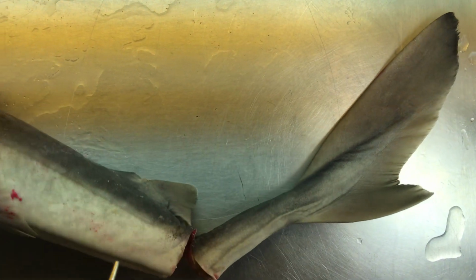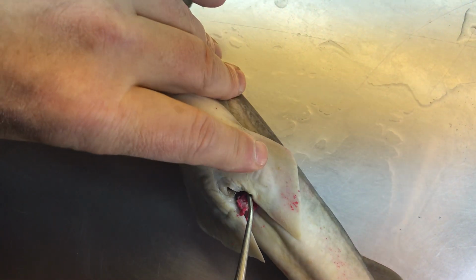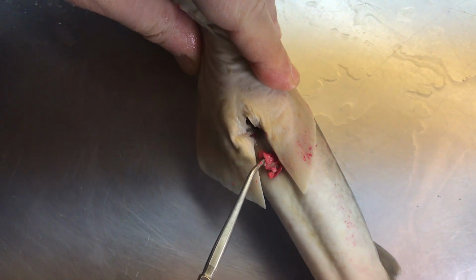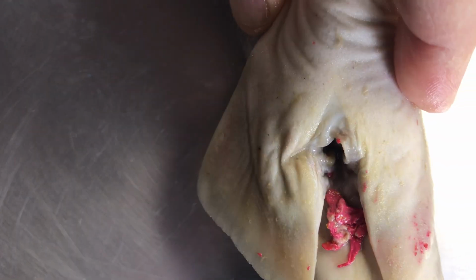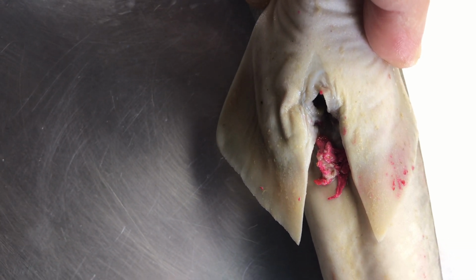Now back to the cloaca here, we should be able to find a urinary papilla. That's going to be this white structure inside there. It would be the urinary papilla. In a female shark, that's just for excretion, for metabolic waste products.